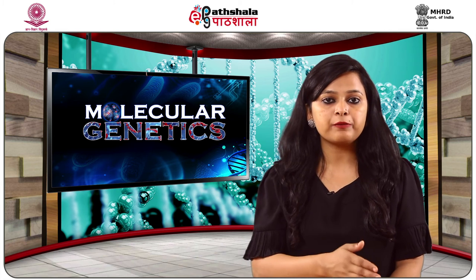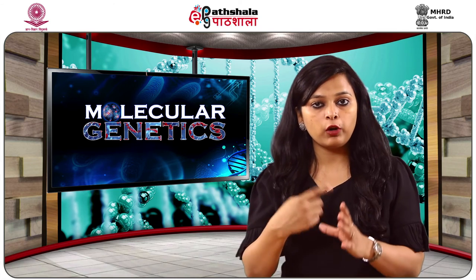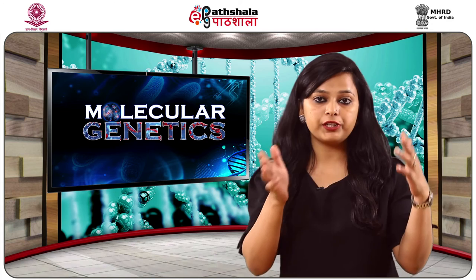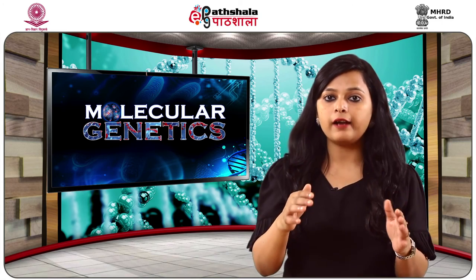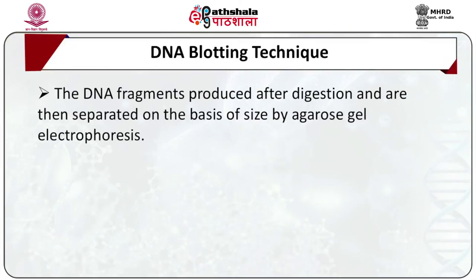But during plasmid DNA preparation, plasmids being small supercoiled molecules unlike the long linear genomic DNA, the cell extract is treated with alkali, which leads to the precipitation of linear genomic DNA and the plasmid DNA is left in the supernatant itself. What is the DNA blotting technique?